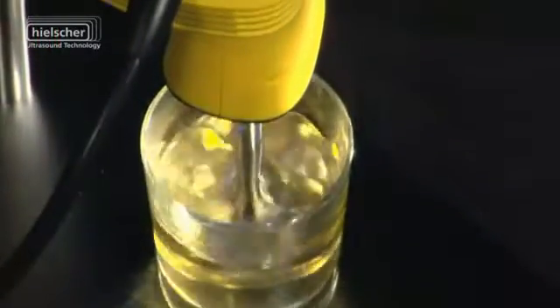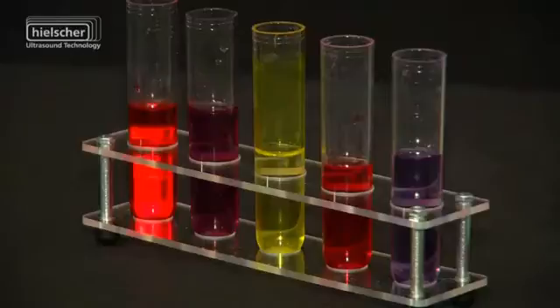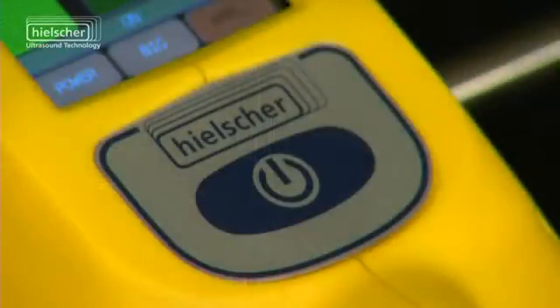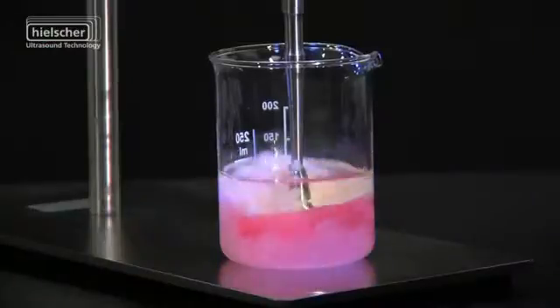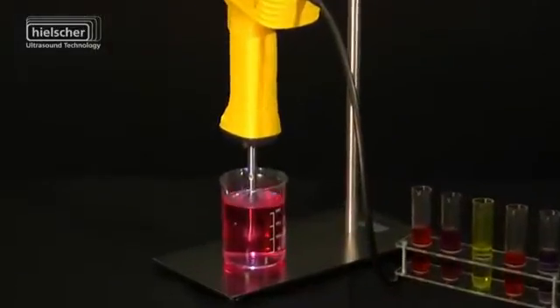Hielscher's ultrasonic homogenizer UP200HT is used in professional laboratories for sample preparation, homogenizing, dispersing and de-agglomeration. Further applications are emulsification, lysis and cell disruption, extraction, degassing and sonochemistry.